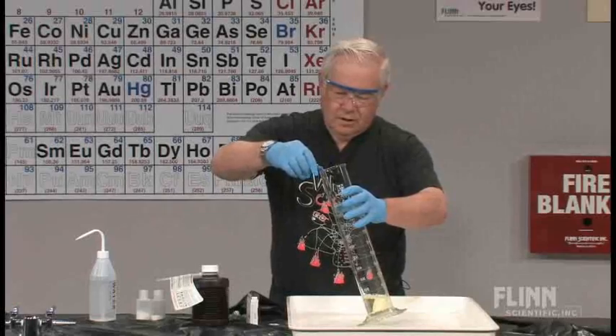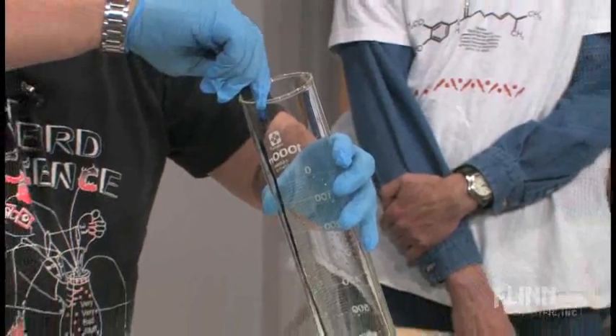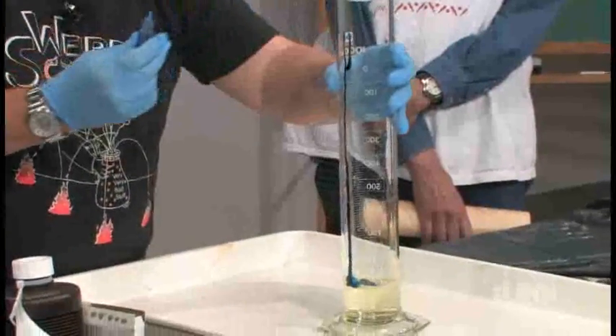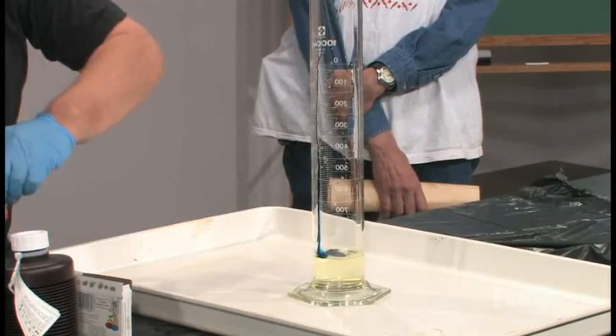Is that your favorite color first there? Yes, favorite color first. Probably won't be this color by the time it's done, but start with that. Okay, and so we'll use one color there.